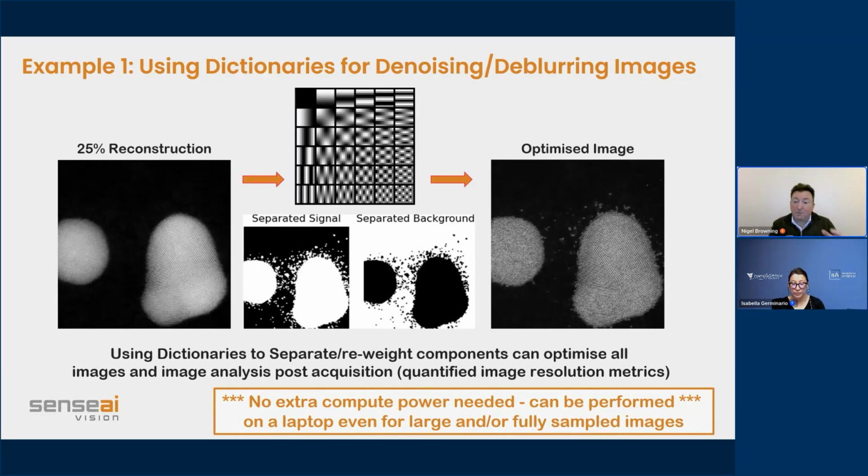We then have the benefit of all the other signals that we're acquiring when we're doing our EELS map. So if you did an EELS map, you could also do an EDS map, you could also do bright field and dark field, all of the ways that you would do imaging, simultaneously. Then use the information in those high resolution maps to help reconstruct your EELS image that you get out of the system.